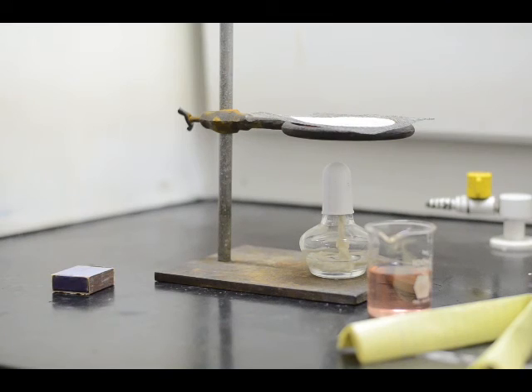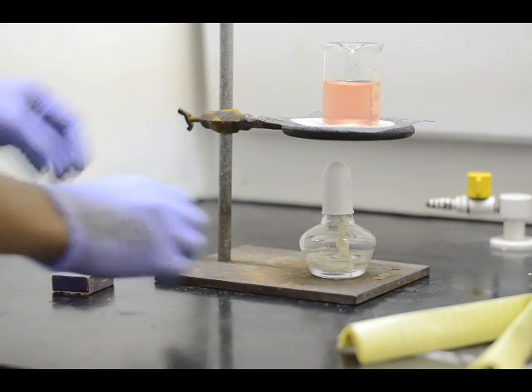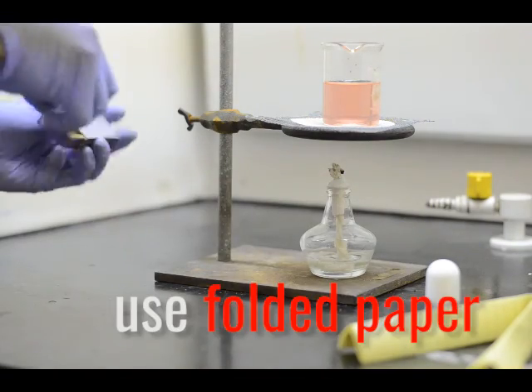When heating beakers, flasks, or dishes, he uses a strip of paper folded several times to hold the beaker.